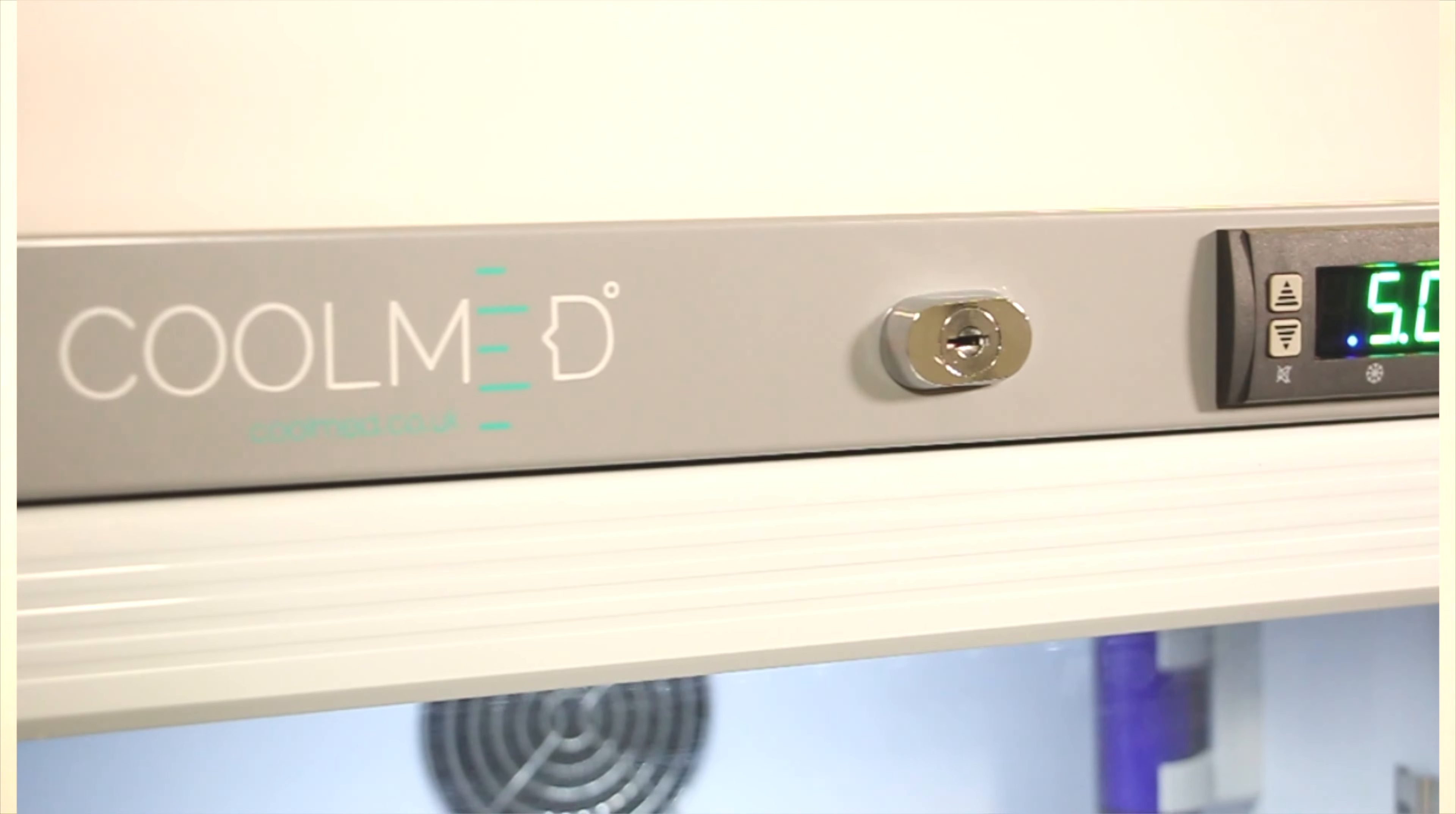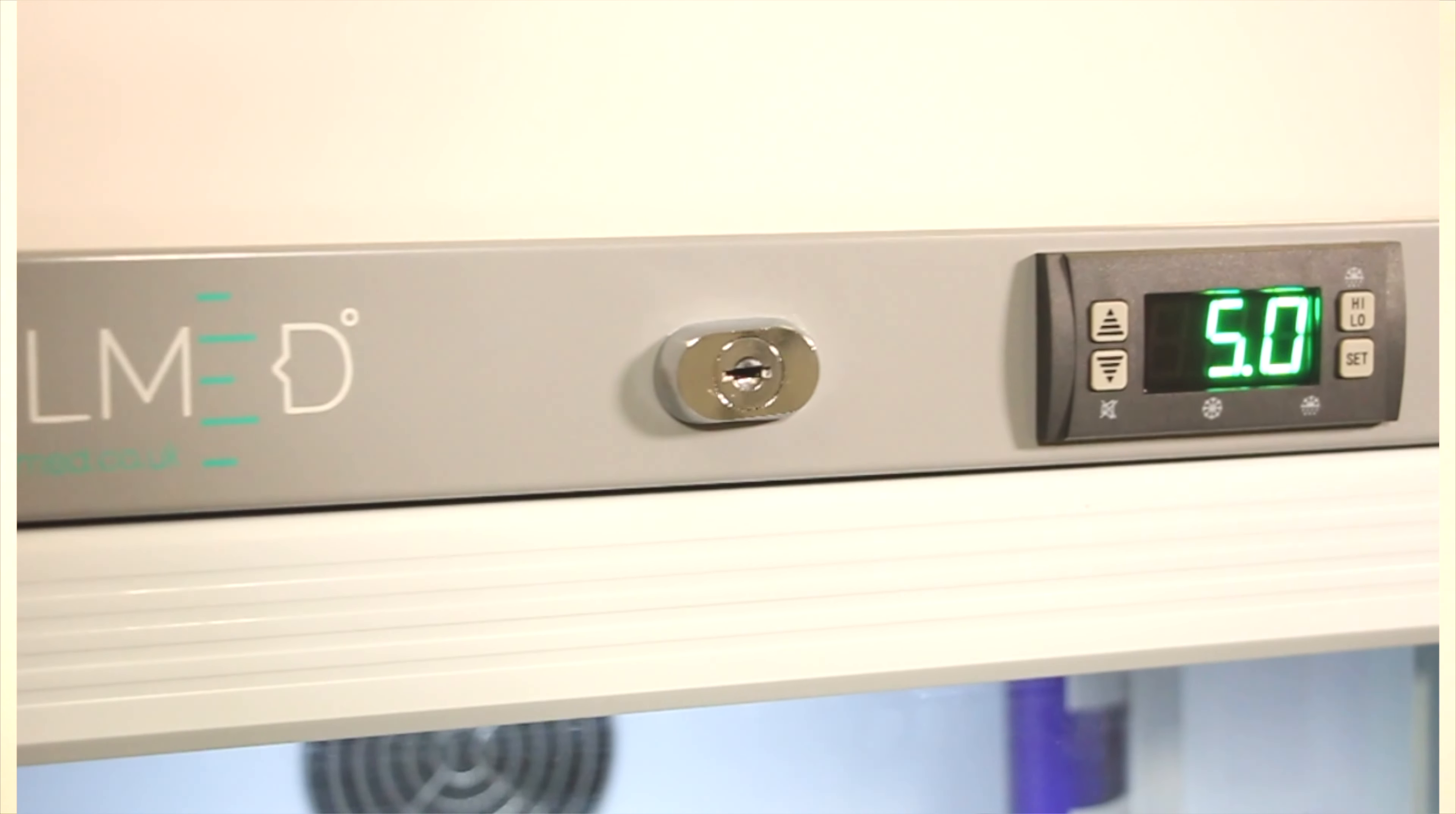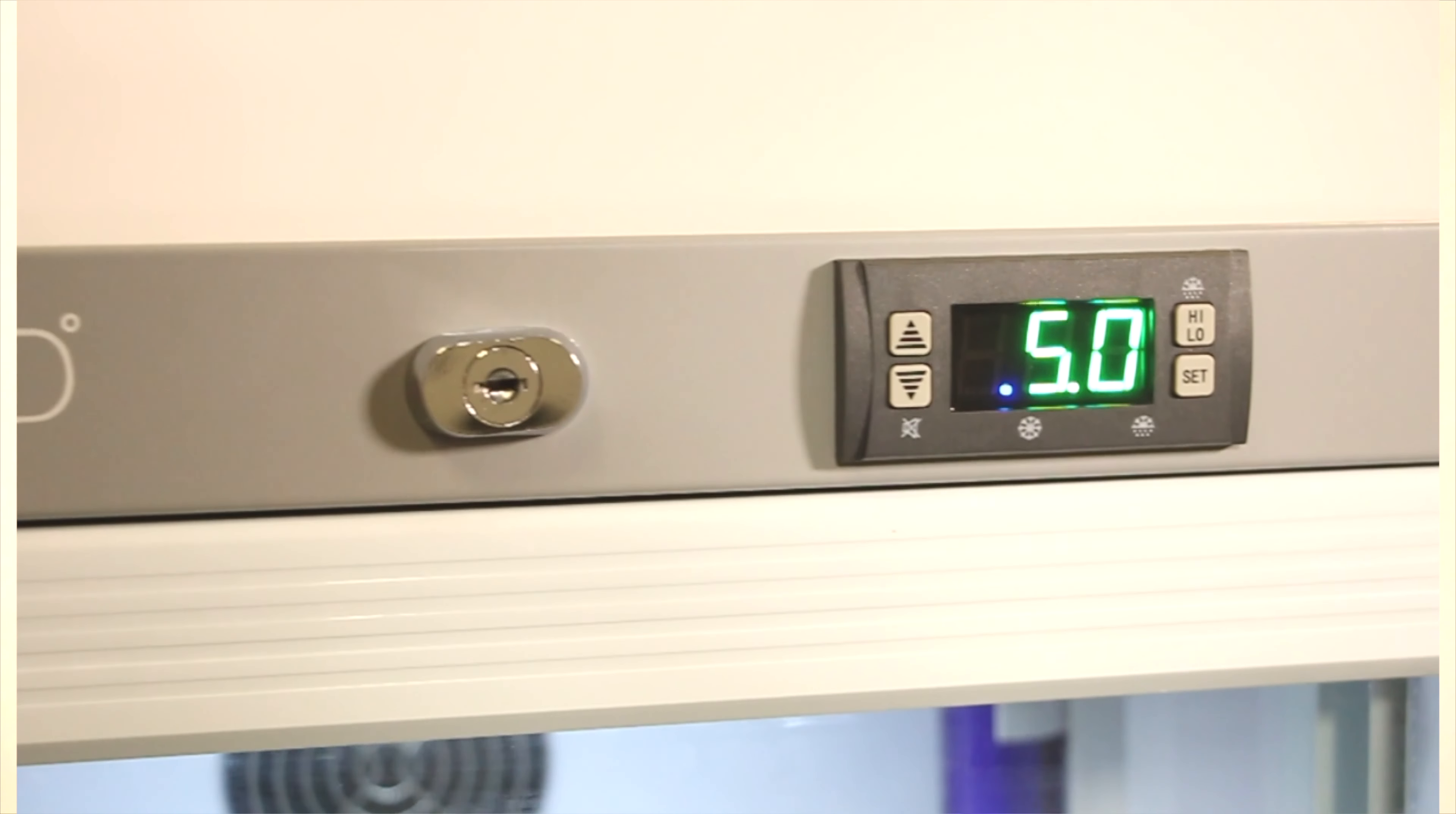The temperature of this fridge is factory set between 2 and 8 degrees. You can then set the temperature between these points using the controller. The fridge will be preset at 5 degrees.